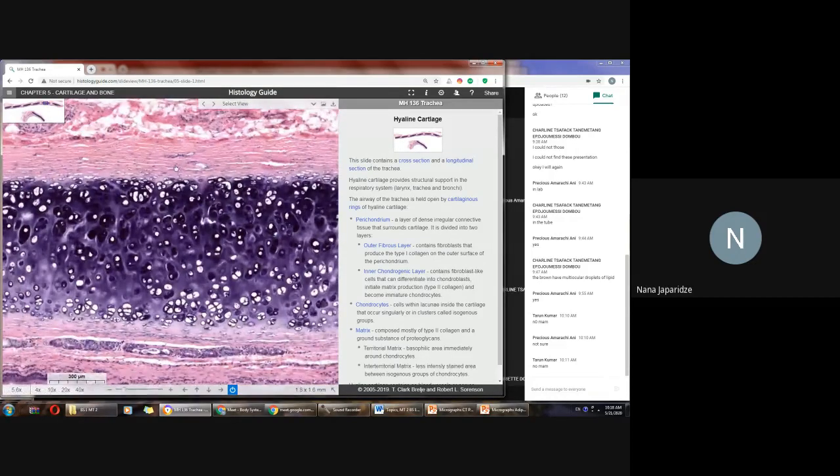That is why this type of growth, I mean, on the periphery of cartilage, from the periphery to the center, is appositional growth. And the growth process which takes place in the deeper layers of cartilage, in the middle on this micrograph, I mean, here, this is interstitial growth, okay?